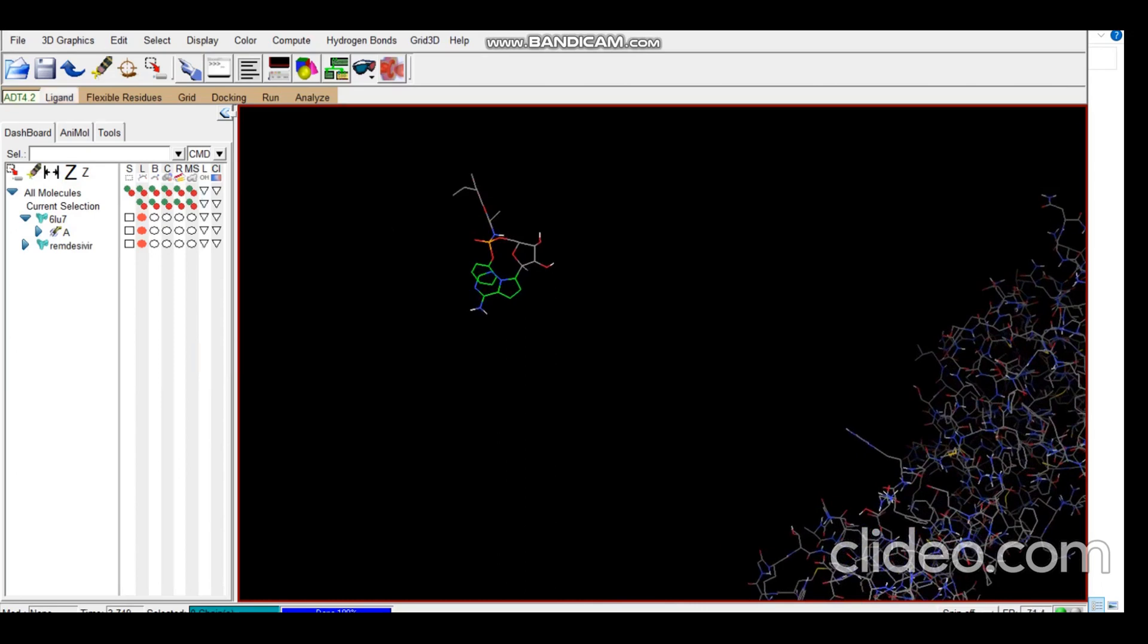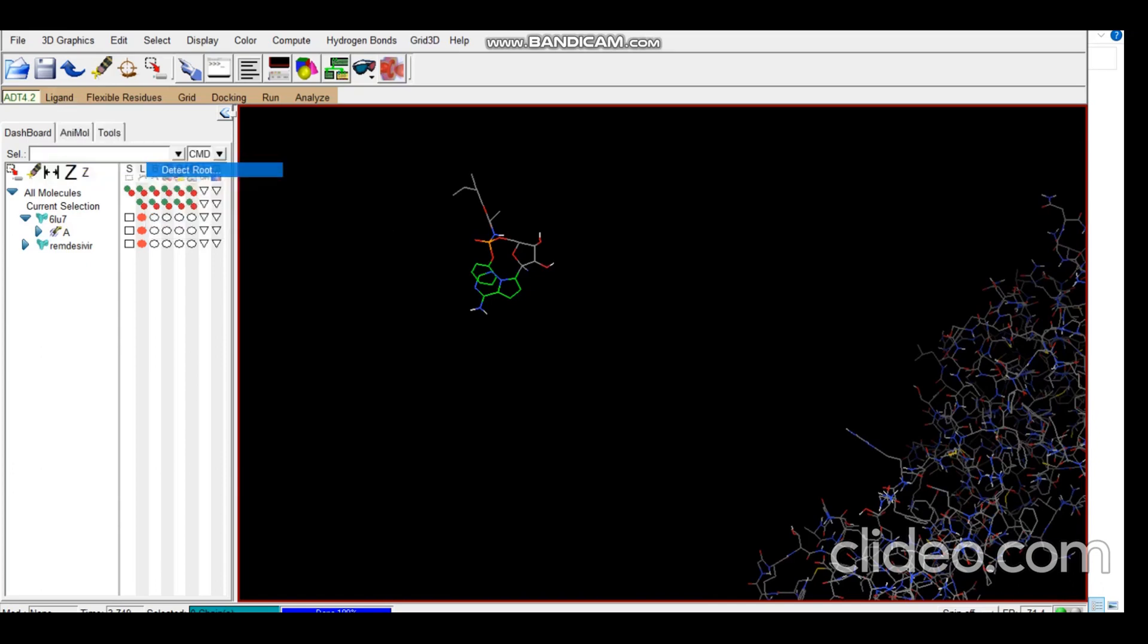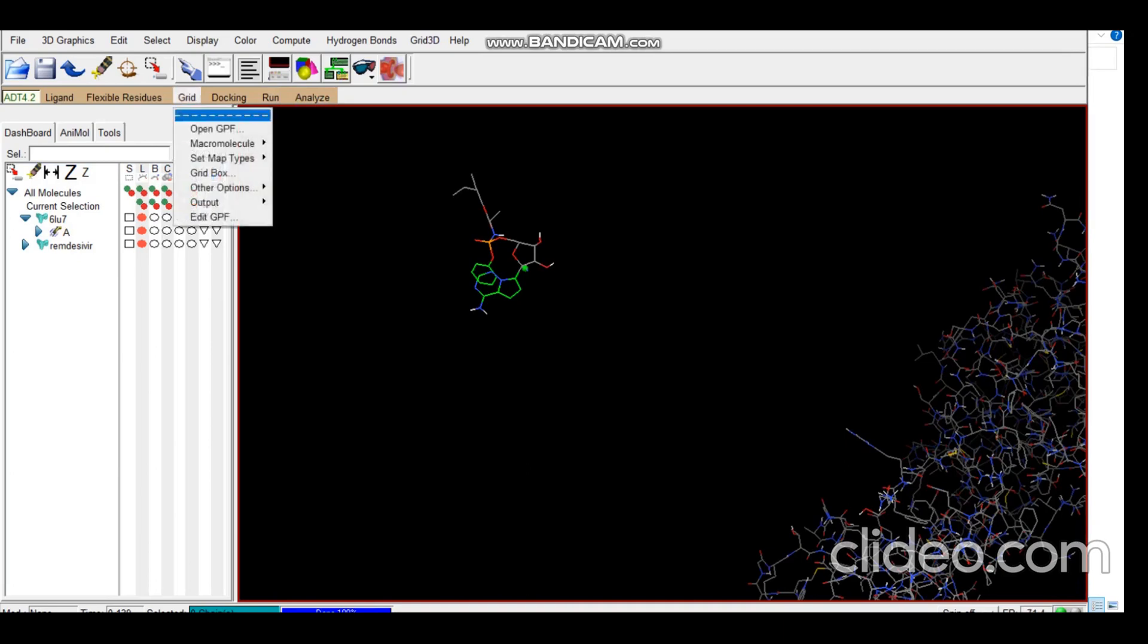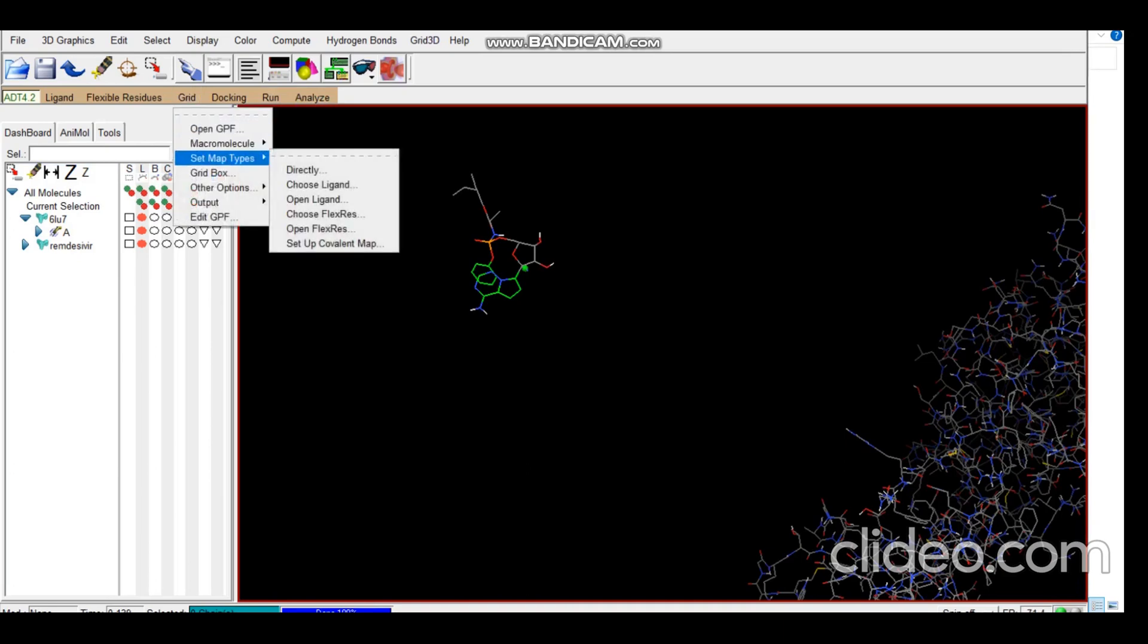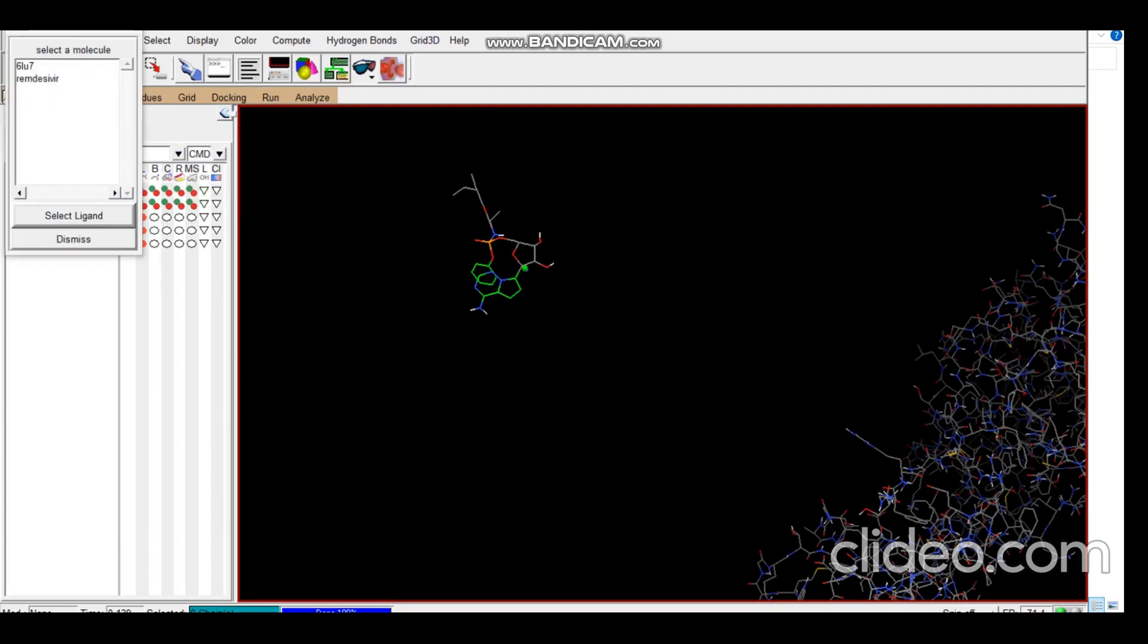Now we need to detect the root. For that we go to Torsion Tree and Detect Root. You can see this highlighted section, that is our root. Now the next step is to choose the ligand, set map types, choose ligand, and select.